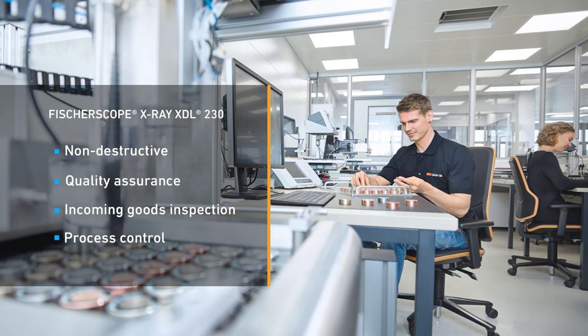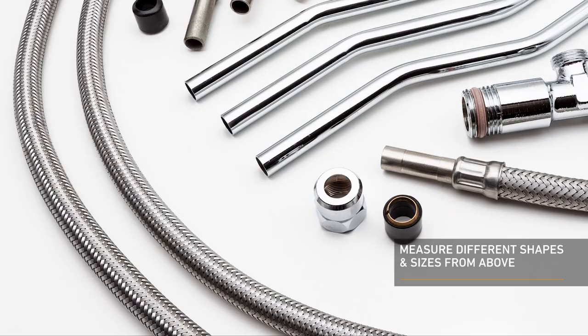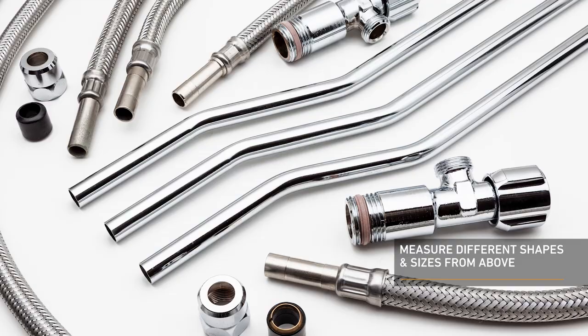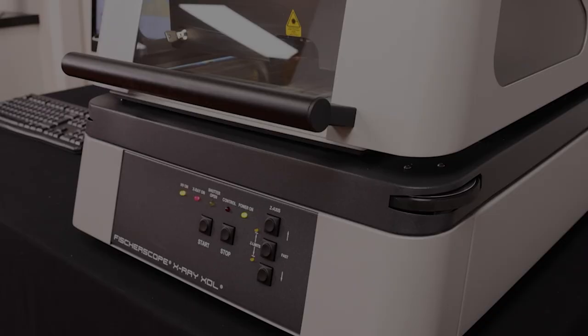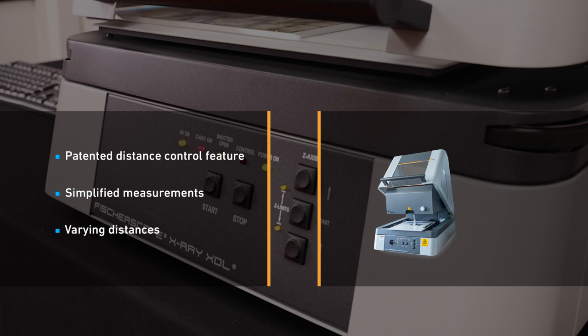The instrument is well-suited for quality assurance, incoming goods inspection, and process control. Testing multiple measuring points is possible. X-ray beam direction is from top to bottom, so the sample is measured from above and can easily accommodate large or small samples.